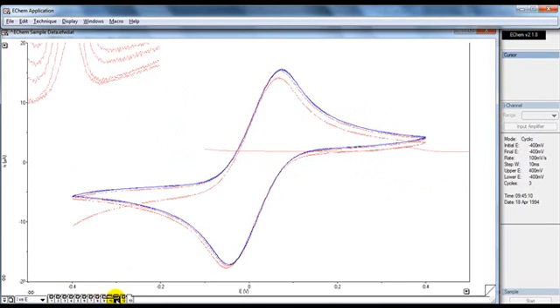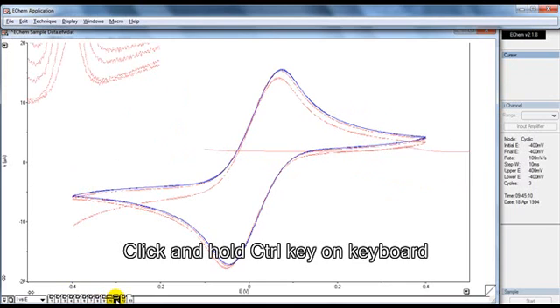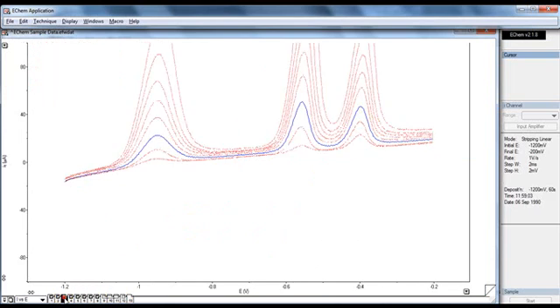If you don't want to overlay these, you click and hold the control key on the keyboard, and then you click on the tabs that you don't want. So 9, 10, 11, 12. When I click back here you can see that those have gone.